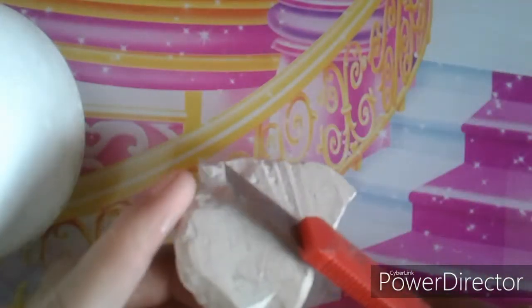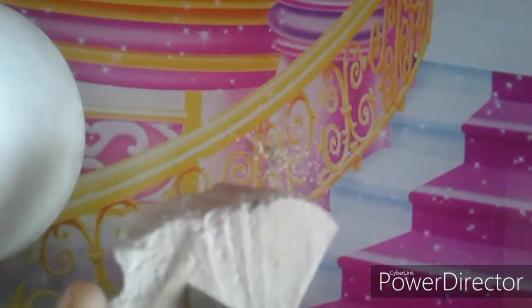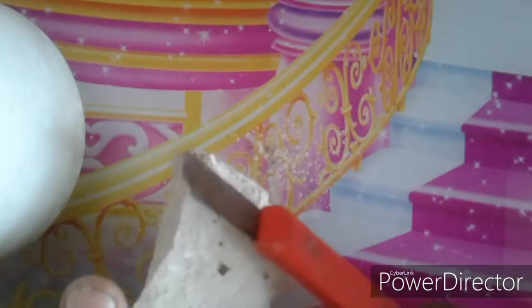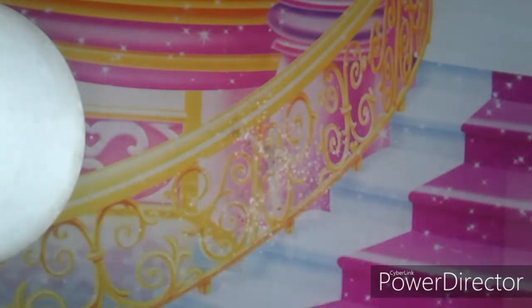Remove the upper layer like this. You can see the impurities coming off in powder form. Remove all of these impurities and then we will check it.